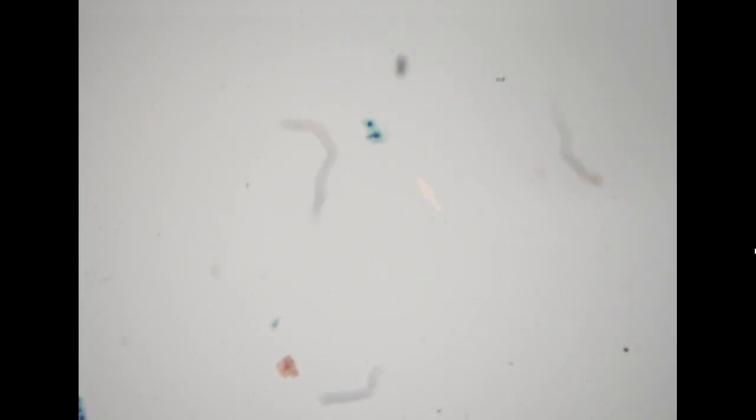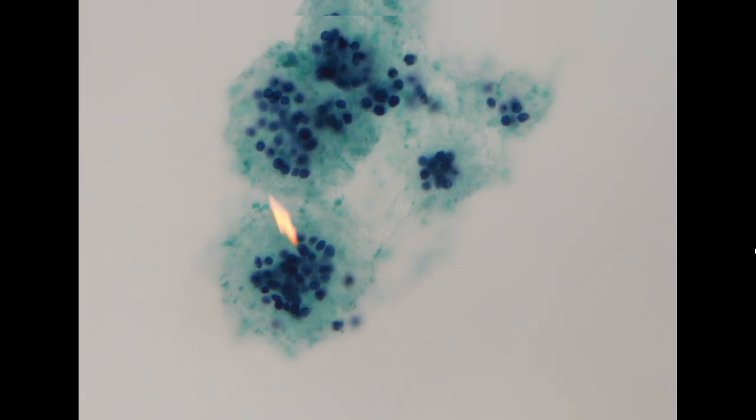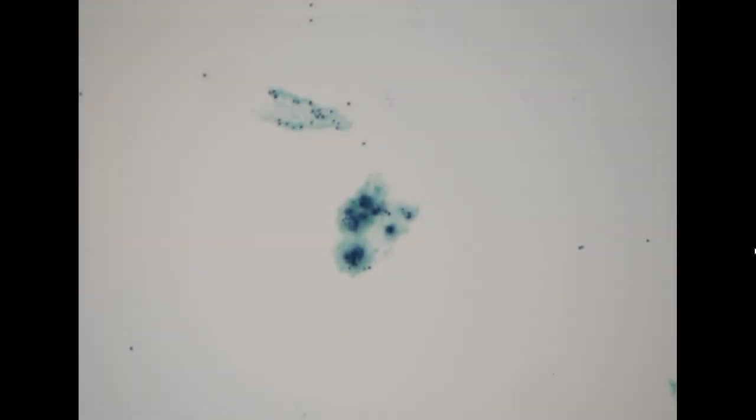So on low power view, it is not very cellular, but we can appreciate a small, very tight cluster of these cells, sort of arranged in a microfollicular type of pattern. We have a very clean background, follicular cells arranged in very tight cluster and without nuclear features of a papillary thyroid carcinoma. All of these cells are rounded, small, with a condensed chromatin pattern and arranged in a small microfollicular type of pattern. So the pattern is suspicious for a follicular neoplasm.